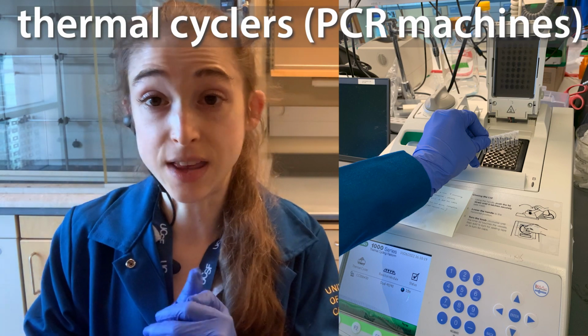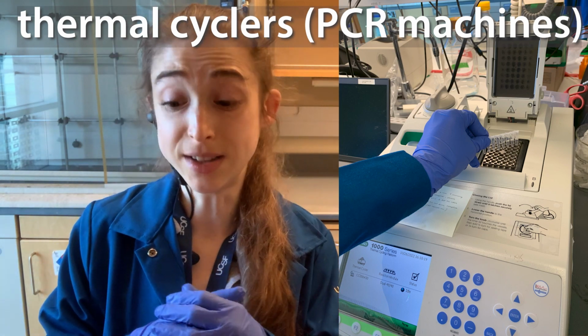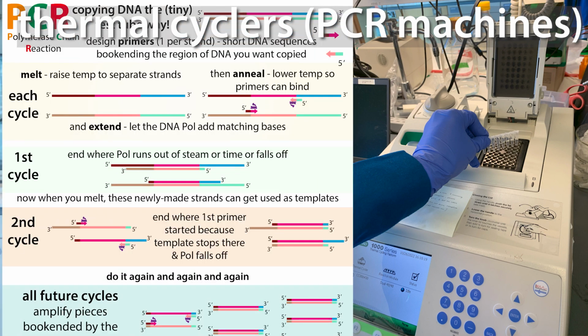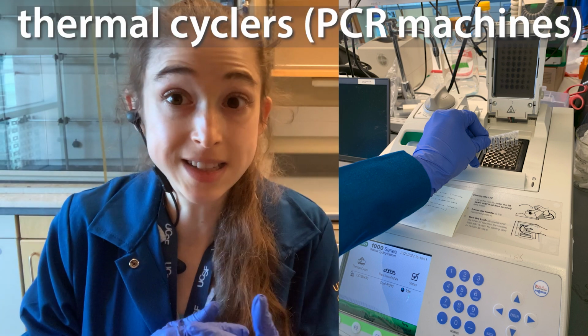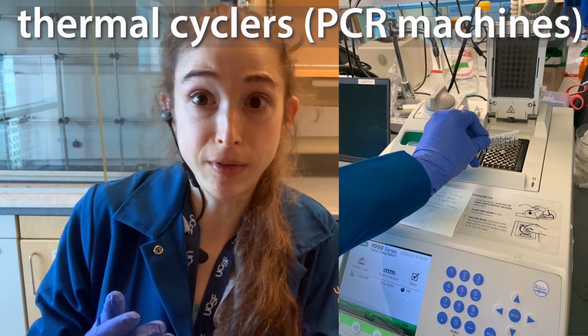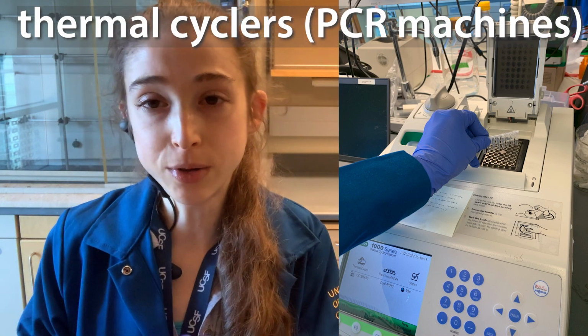So this is a thermal cycler. Sometimes we call these a PCR machine because we typically use them for PCR, where we get things hot and cold and hot and cold and hot and cold and hot and cold. And in the process of doing all that, we are making lots and lots of copies, or amplifying regions, of DNA. The machine is really great because it can get hot and cold really fast. We can also, however, just keep it really hot or keep it really cold or anywhere in between.